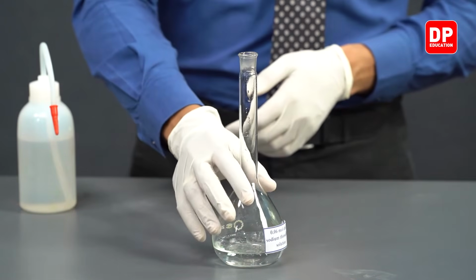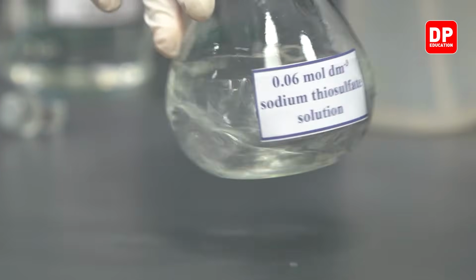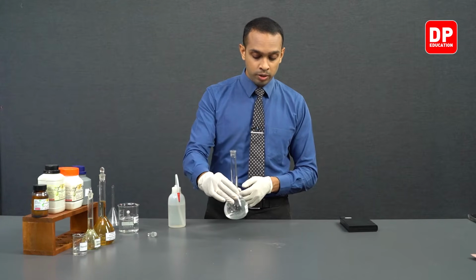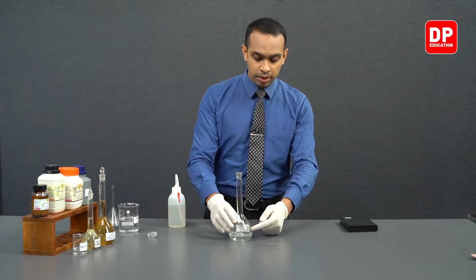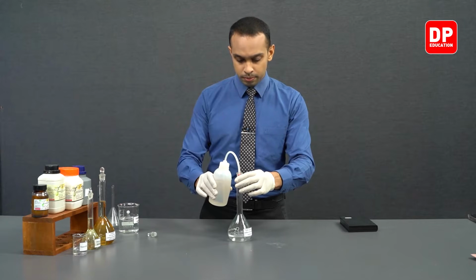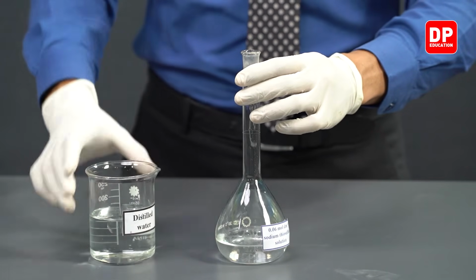Then we can mix the contents in the volumetric flask before we proceed to add more water to the volumetric flask. You can see all of the sodium thiosulfate has now completely dissolved. So now we can proceed to add more and more water. You can use a beaker as well.